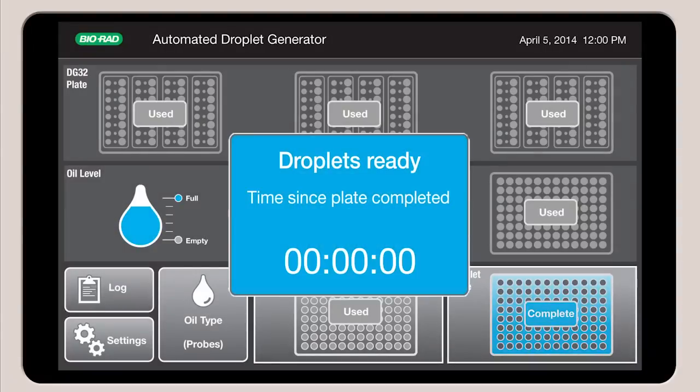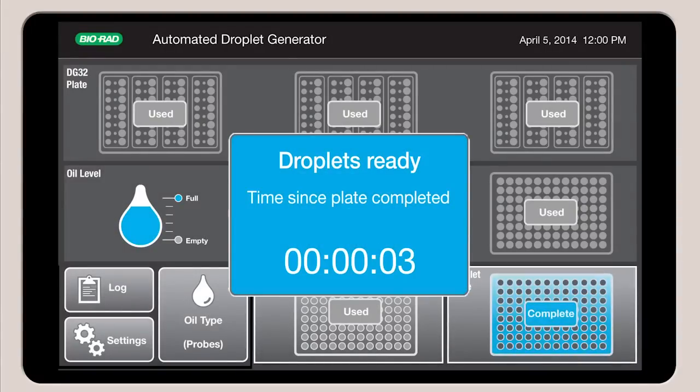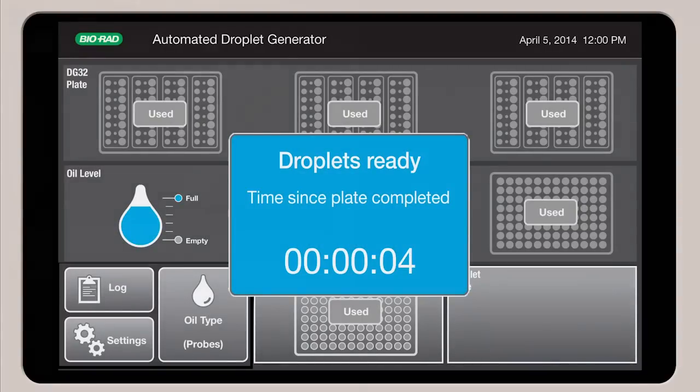A timer then indicates how much time has elapsed since droplet generation was completed.